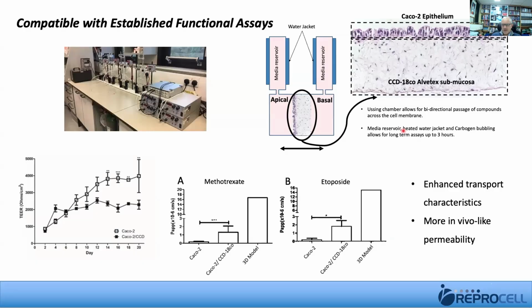With this model, we can take the inserts, put them in between 2 chambers, and create an Ussing chamber system to enable us to study the electrophysiology of the model and the transport of molecules across that tissue construct. So that's the rig that we've set up for that purpose.